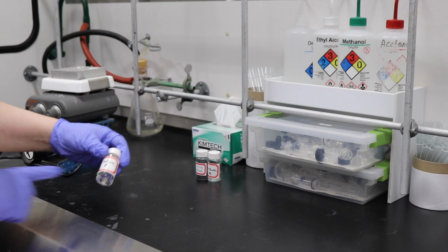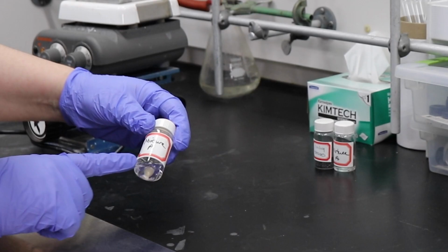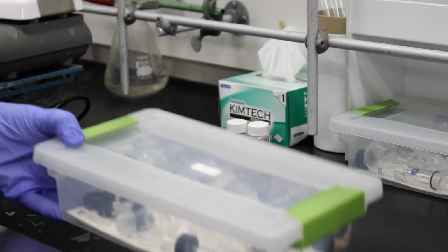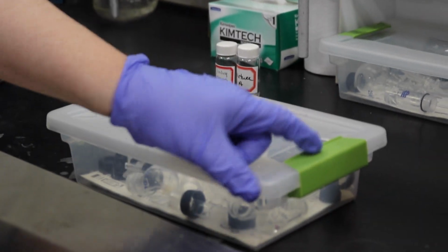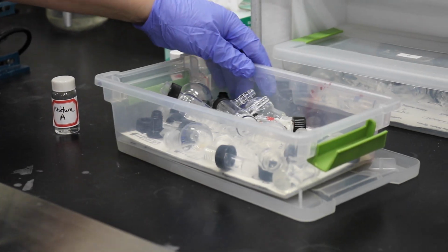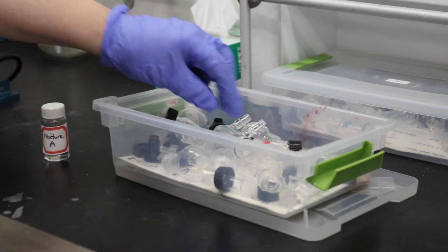So today we're going to separate mixture A. Mixture A is a mixture of two different compounds. We're going to use simple distillation to separate the mixture. To do this, we're going to open up our microscale kit, as you see here, and take out the pieces of glassware that we need.